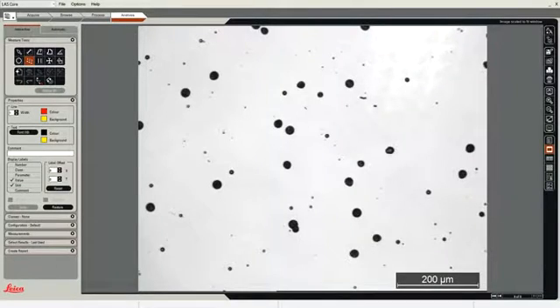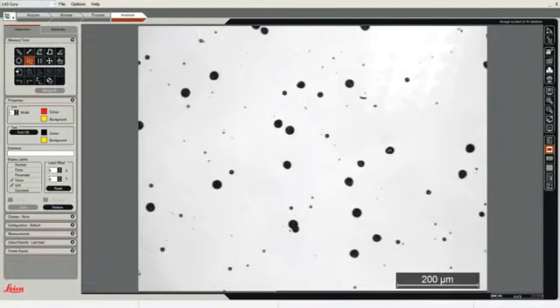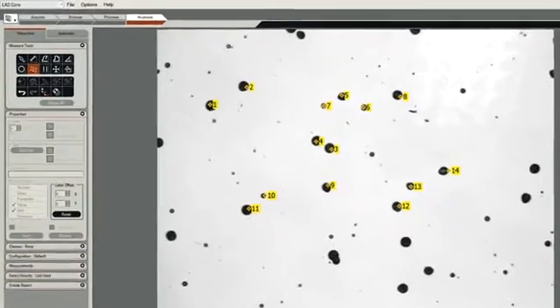One of the measurements that is frequently required in examining images is a simple way to count the number of objects that are in the field of view. In this simple AlphaTrack specimen, you might think that you can easily click on each individual object and count the tracks. It's quite simple and doesn't take very long to count one image. But if you had many images to count, you might find that a little tedious and time-consuming.